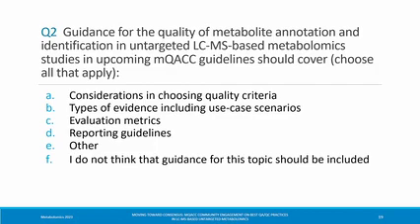So this might be a different way to think about it. Before we actually go ahead and do any type of annotation or identification, we actually look at the quality of the actual feature changes, right? We first identify what's the apparent fold change, what's the CV, how consistent that feature is across the multiple different groups. So we don't bother annotating until we have something that seems to be a statistically significant change.